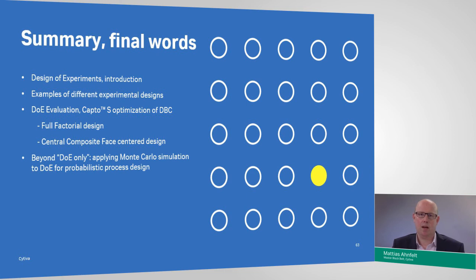We started out by introducing DoE and the rationale for DoE, talking about some key concepts in design of experiments, like the model, the transfer function, different complexities that we employ in DoE modeling, linear effects, two-way interaction effects, and second-degree curvature. We also discussed how all the experiments we run in a DoE are used to quantify not only the cause and effect relationships between our process inputs and outputs, but also the random variability or the uncertainty of our process performance.